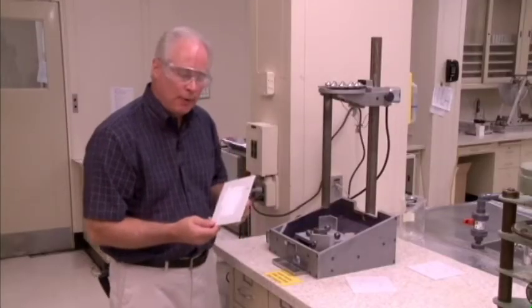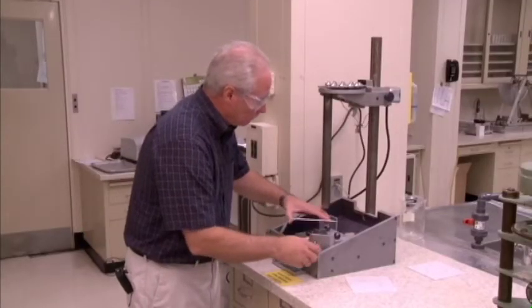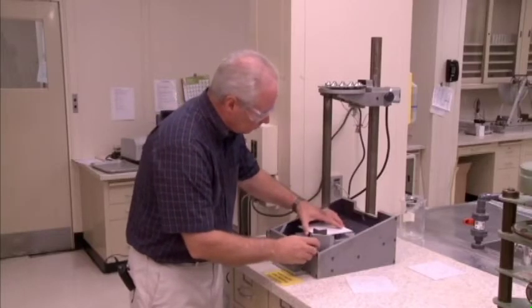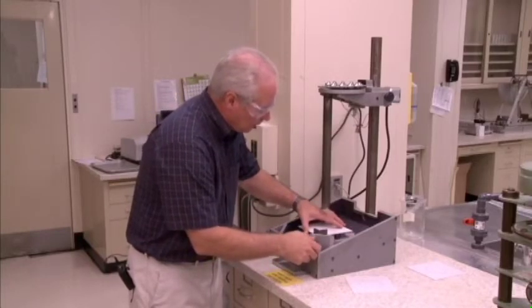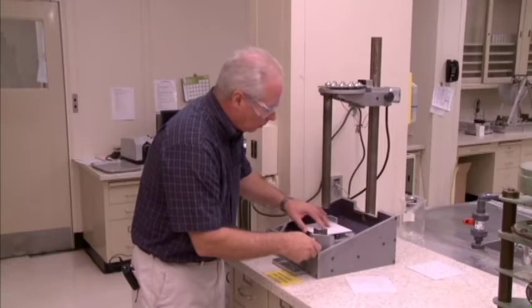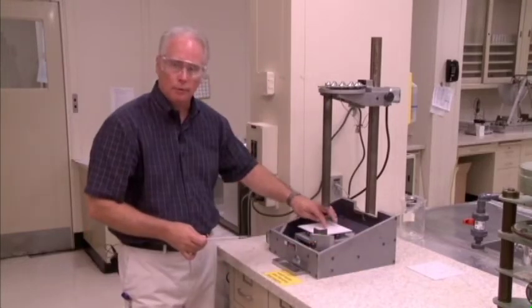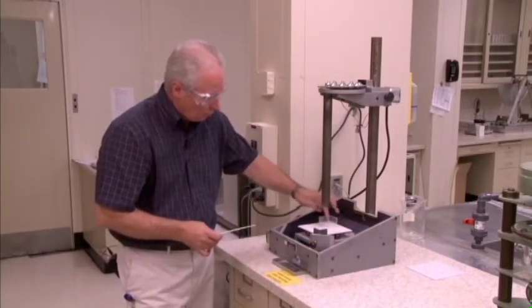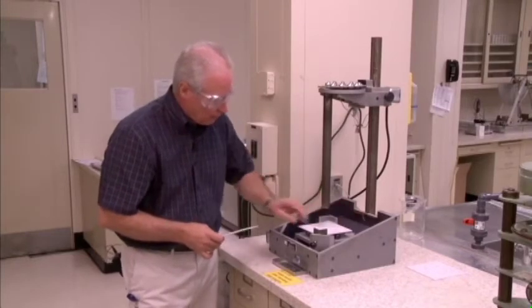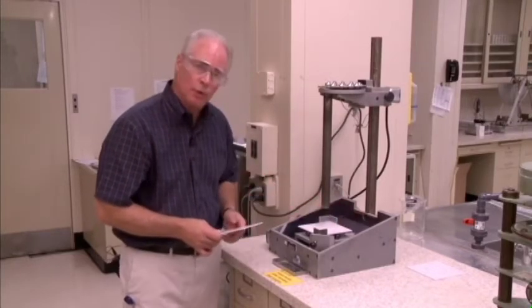Then mount that in the test equipment face down such that that three inch diameter circle is really unsupported. The tile is supported on three balls around the edges so the center section is unsupported.